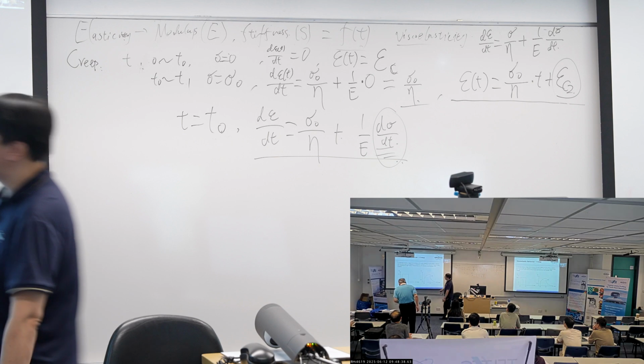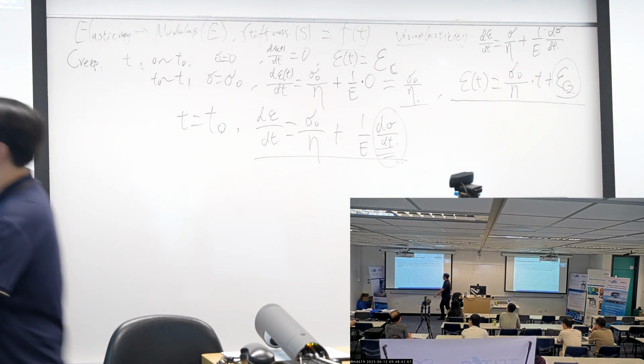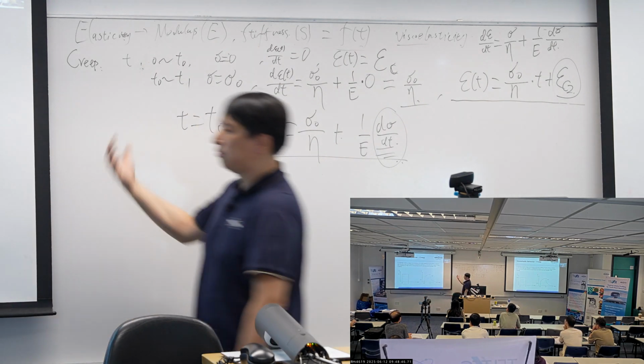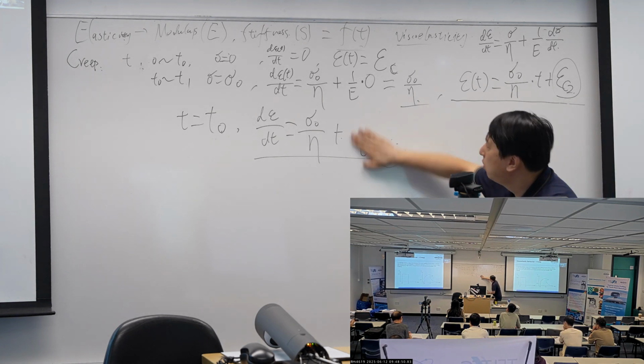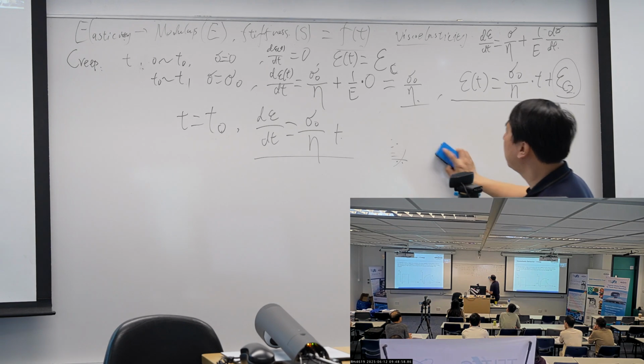If we ignore the deformation change from 0 to t0, we just consider at this point the speed is reduced to 0, so we can ignore this term. But I cannot get it out.